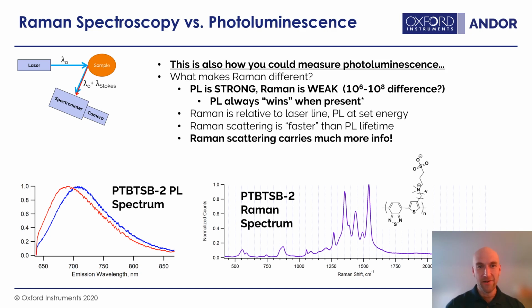Third, Raman scattering is faster than photoluminescence. We'll say what that means. And Raman scattering carries, in my opinion, and perhaps objectively, much more information.